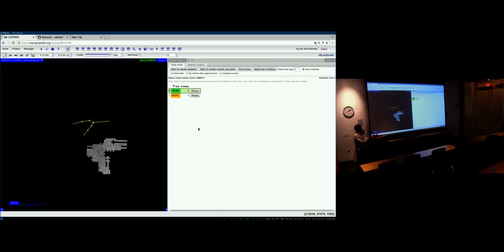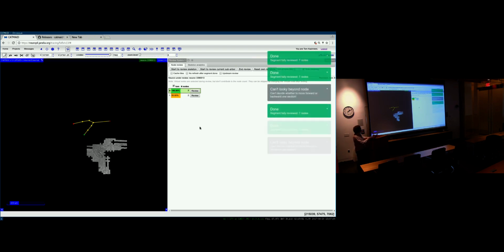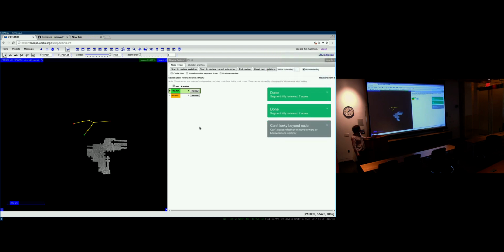And this is also taken into consideration when using Shift, Q, and W, which you can use to jump over already reviewed nodes. Because currently, one comment that reached me this morning, which is a change in this release, unintentional, but still changed, is that if nodes are reviewed, you can't actually walk through them anymore with Q or W.